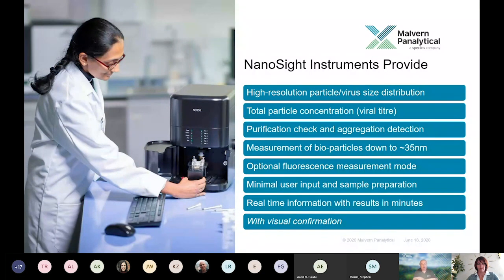Now ultimately, if we have any concerns that the presence of these excipients will influence refractive index, honestly, a handheld refractometer, a couple of £100, you put a drop on it and it will measure the refractive index for you. But I suspect it's going to come out at the same value as water, or very, very close to it.